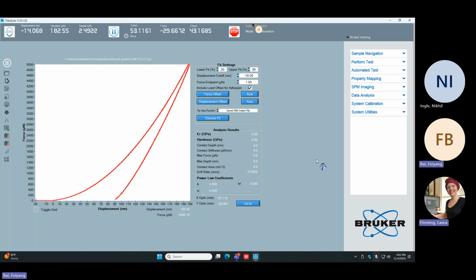Yeah. In any case, now we're back over the sample surface. We can tell we've stopped moving. My sample force is updating. We are a little high there. So you can go ahead and zero that out if you'd like. It looks like we have a little bit of drift. Zero. So now we can see our sample force is back to zero-ish.